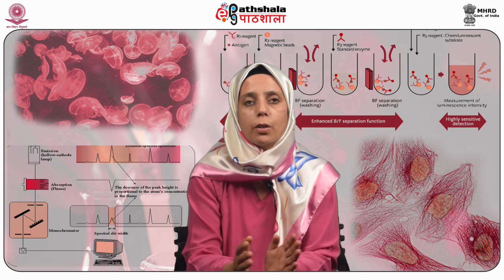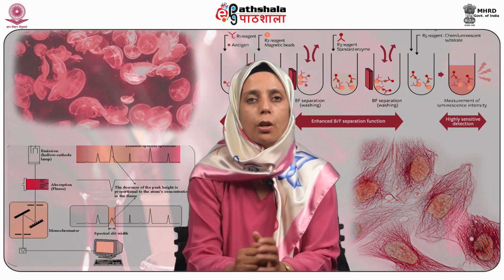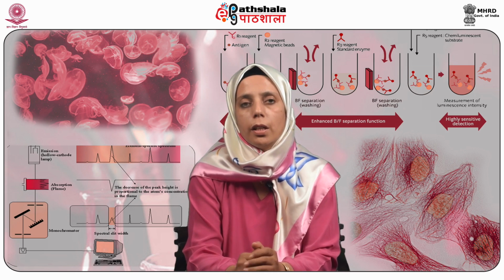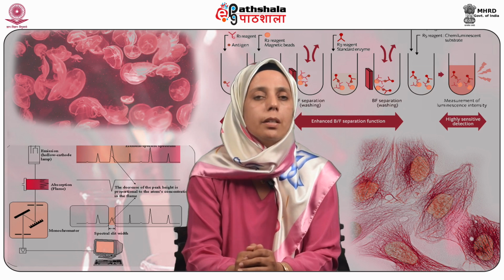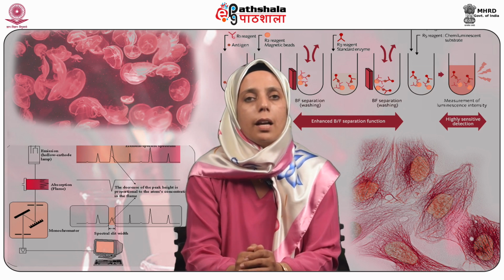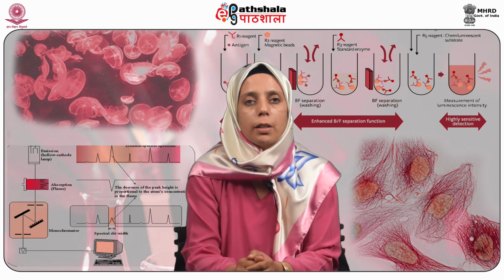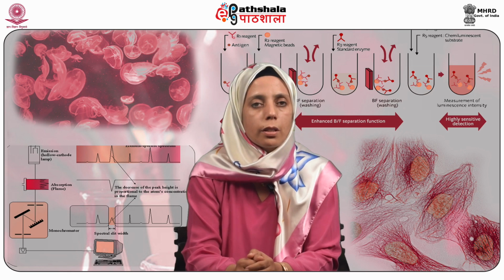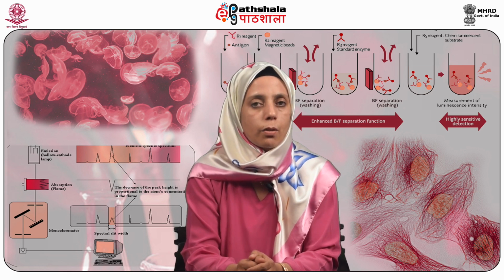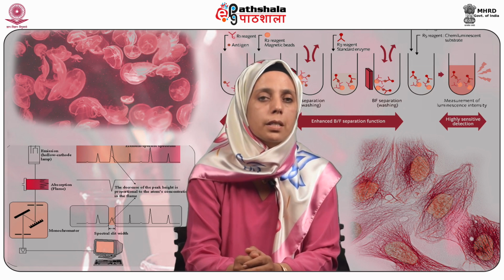Qualitative means you can distinguish each and every element, and quantitative means you can determine the quantity of the particular element. The potential of atomic absorption is such that it can be used to analyze at least 62 elements. The process of converting sample into vapor is called atomization, and the precision and accuracy of this procedure in atomic absorption spectroscopy are critically governed by this step.